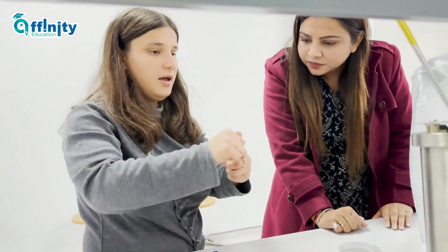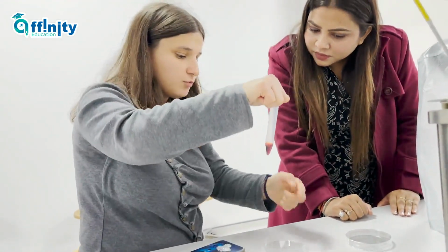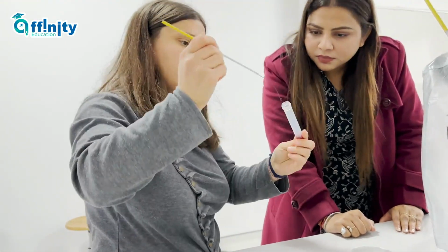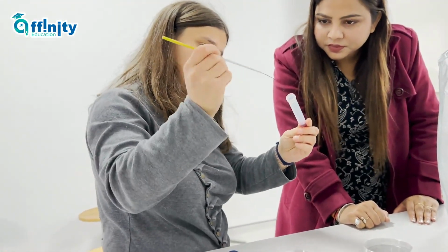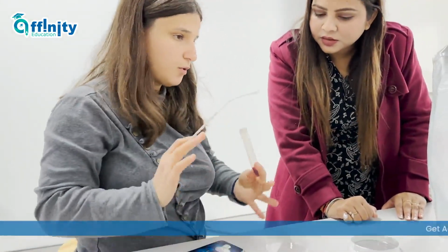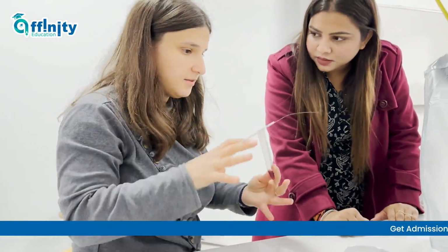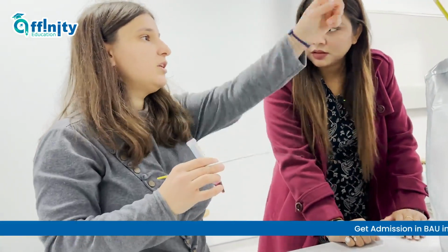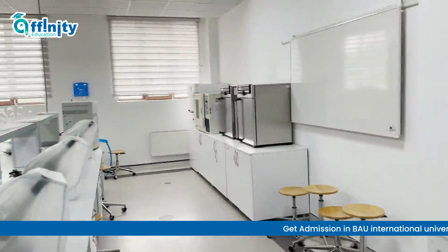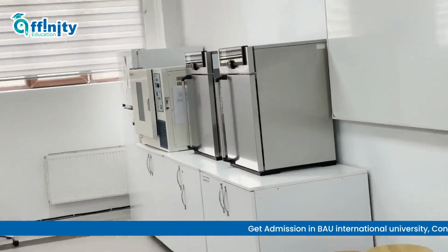And from this one food, they should move here. Here it's different food, because we should make colonies. We take it from here like this with this thing, and do like this, so they will grow properly in different kinds of food medium. Then we put it in this, which I said is the incubator, because they need specific temperature and specific environment.